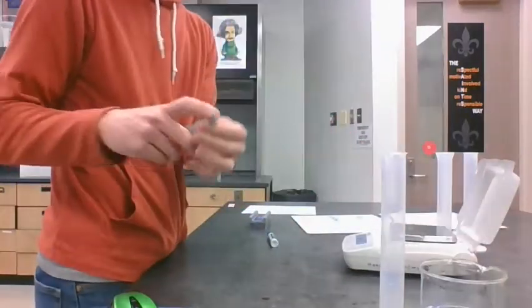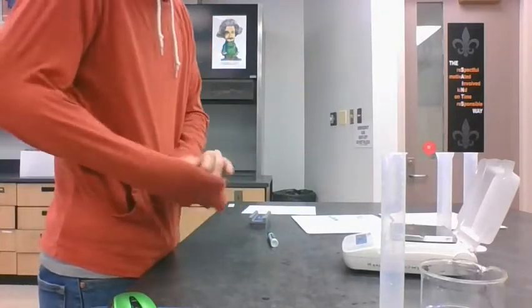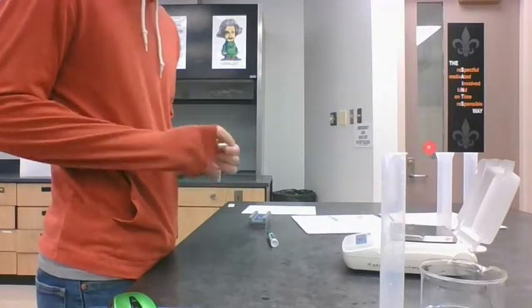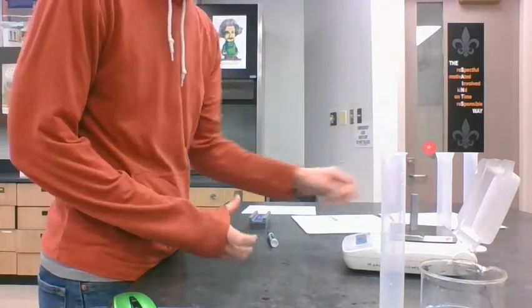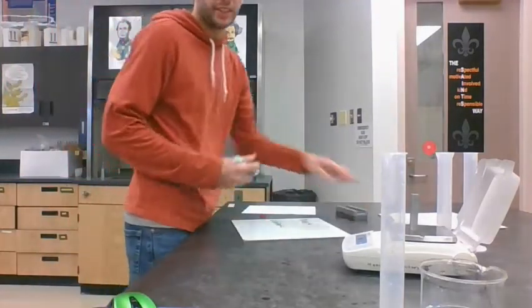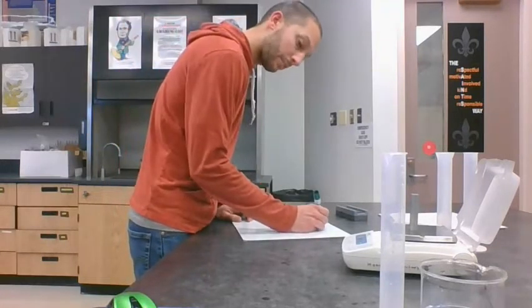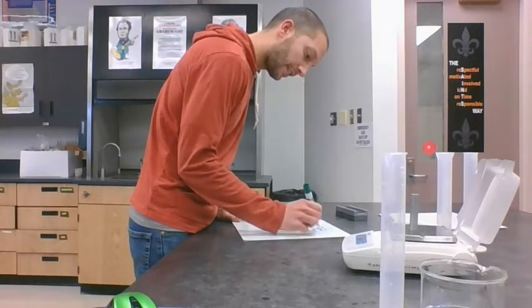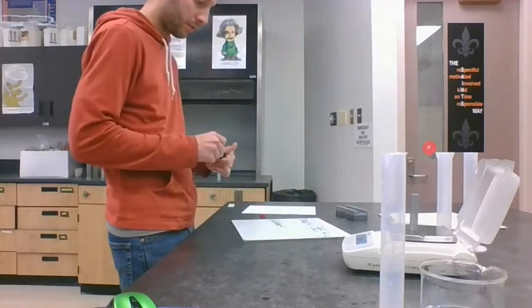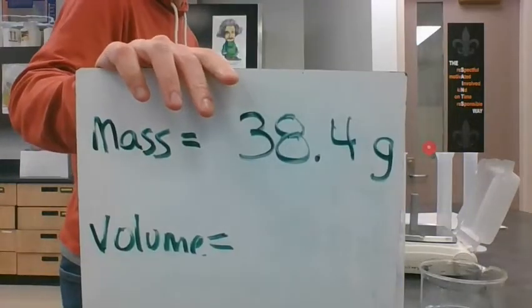This piece is almost a finger length, an even bigger piece. Let's try that one. You should be able to guess about what this is going to be from there. It is 38.4 grams.